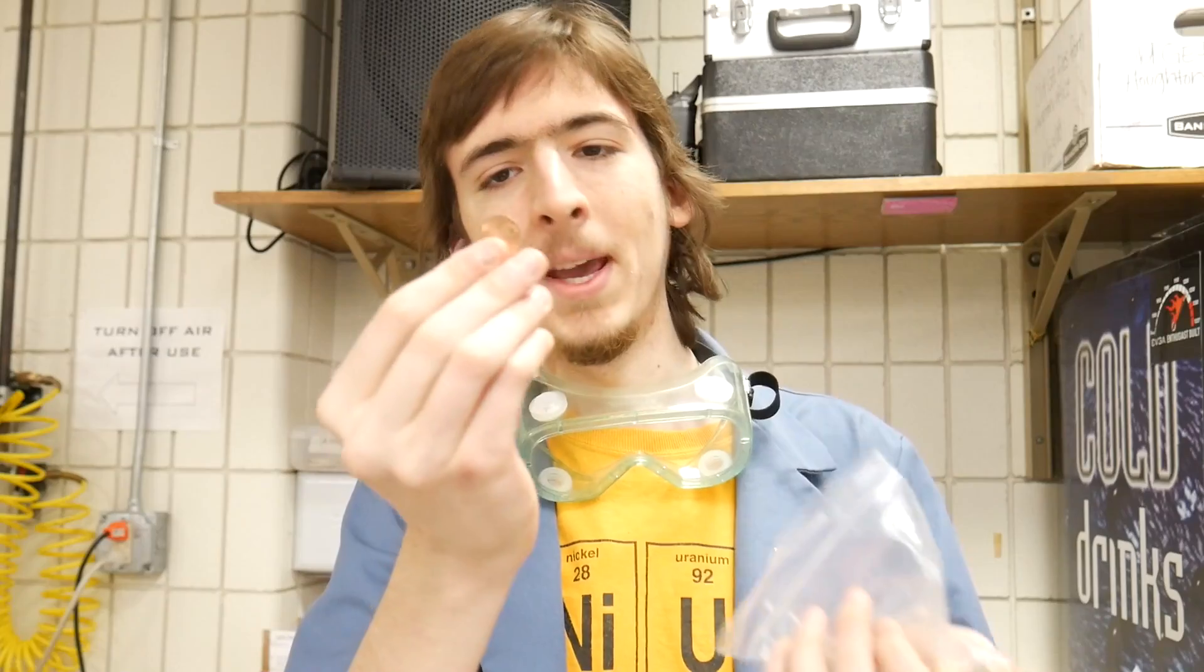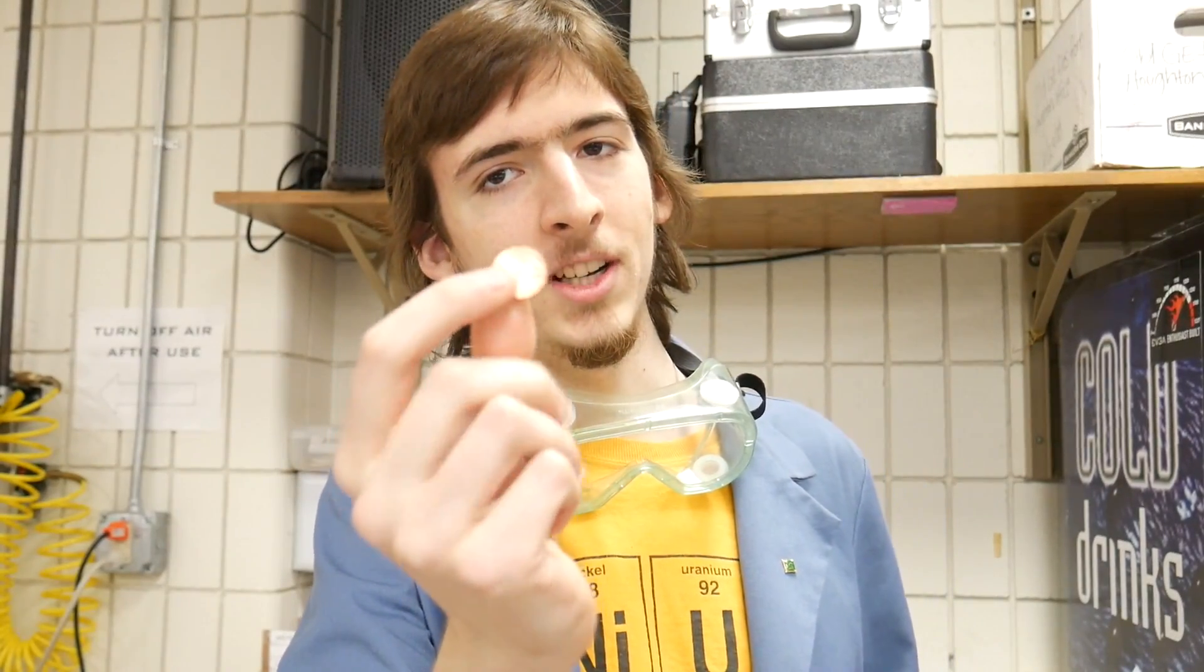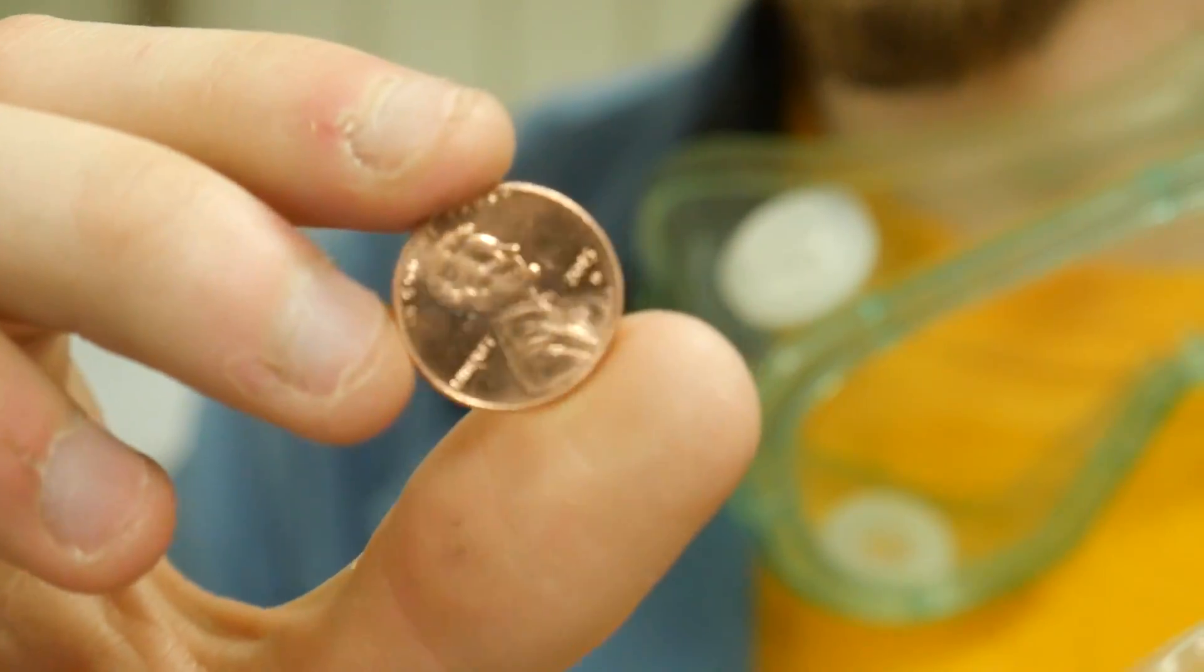Zinc is pretty easy to come by. You can take any old US penny. Although the outside is coated in copper, the inside is entirely zinc. A shrewd haggler like myself was able to get 100 pennies for only a dollar.